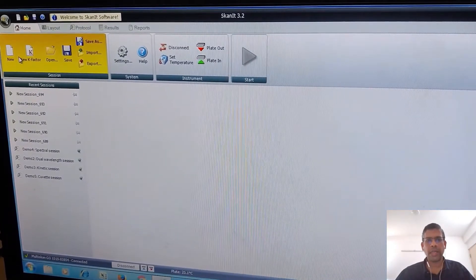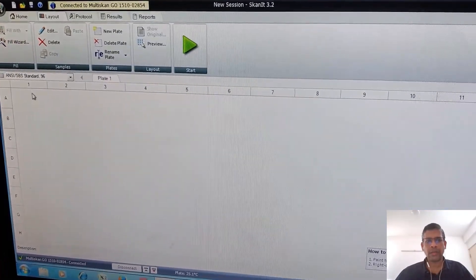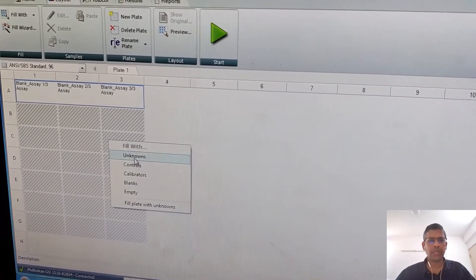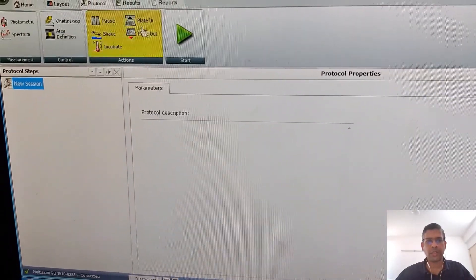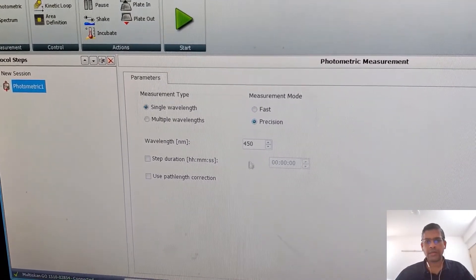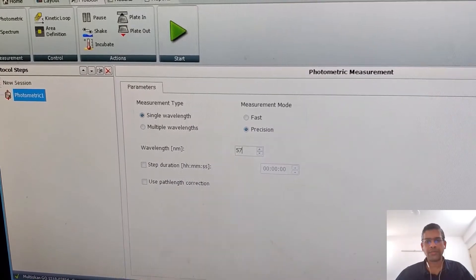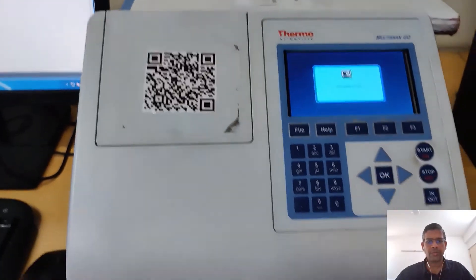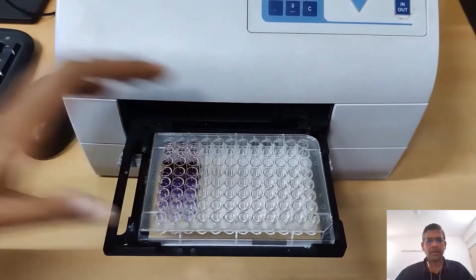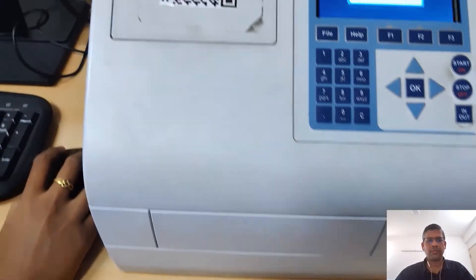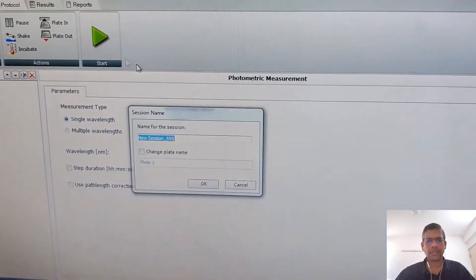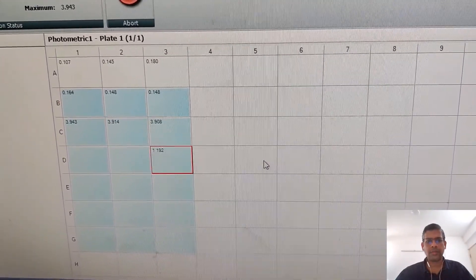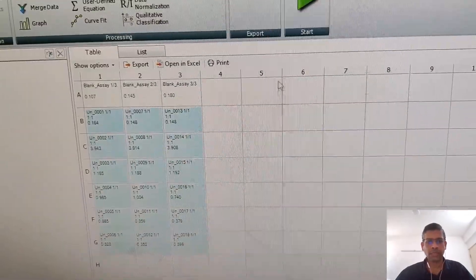We then measure the absorbance for the treatments, the controls, and the blanks. We prepare the plate format and set up the absorbance reader at 570 nanometers. Once set up, the plate is placed in the reader and we take readings — getting absorbance values one by one for the blanks, controls, and treatments.